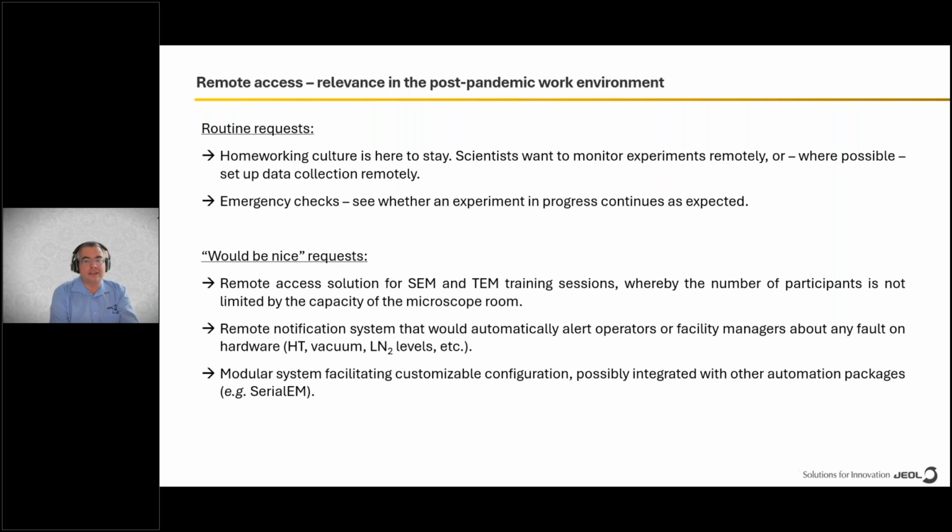So we're getting questions from our customers on whether JEOL could offer training sessions, whether JEOL could explain how to control our machines while working from home. With low-end systems, this is quite easy. With our higher-end systems, such as the cryo-arm, this becomes more difficult because while we can analyze a sample while working from home, we cannot refill liquid nitrogen, for example.